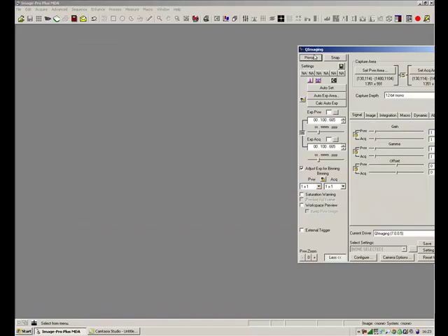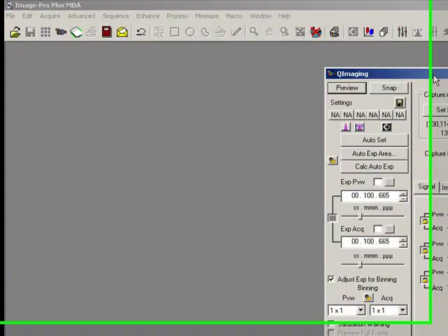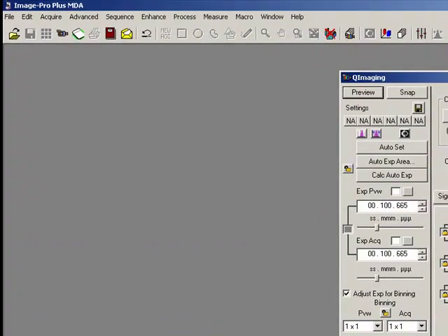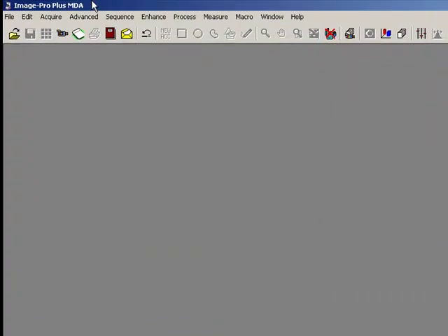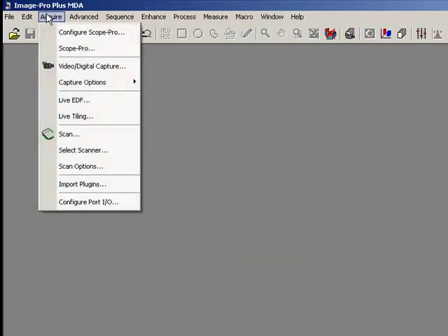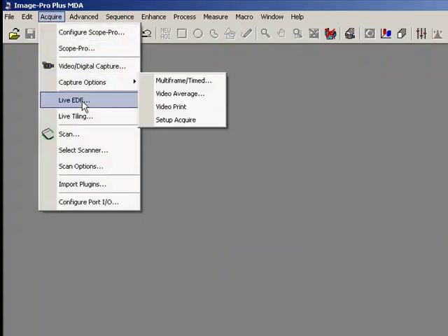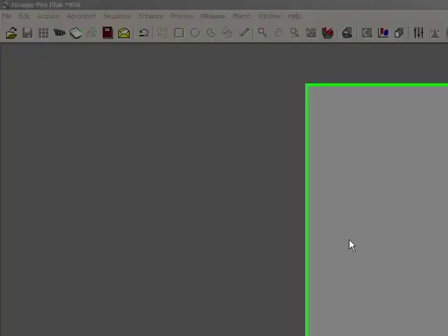But what we can actually do now is use the Live Tiling plugin for Image Pro, which is under Acquire and Live EDF.